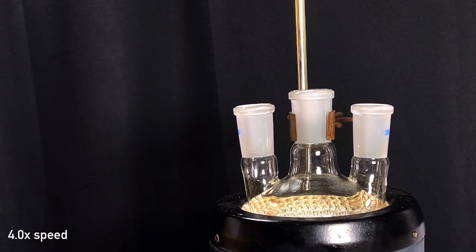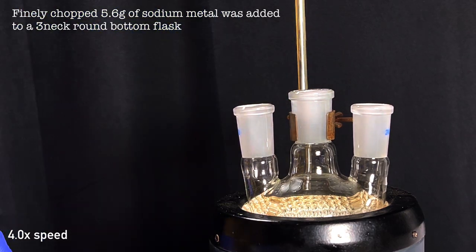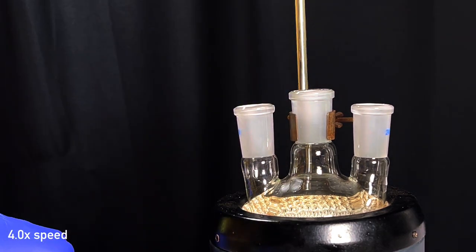Place a 250 ml three-neck round bottom flask in a heating mantle and add 5.4 grams of finely chopped sodium metal to it.